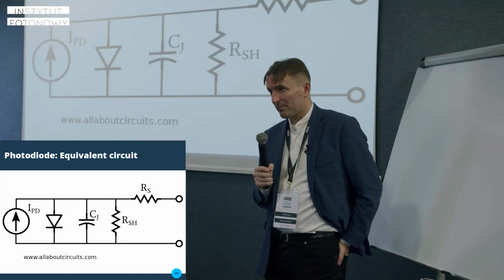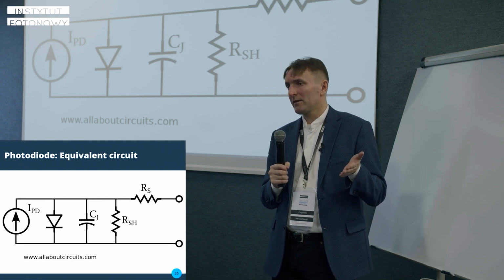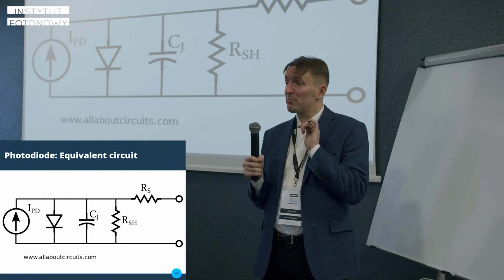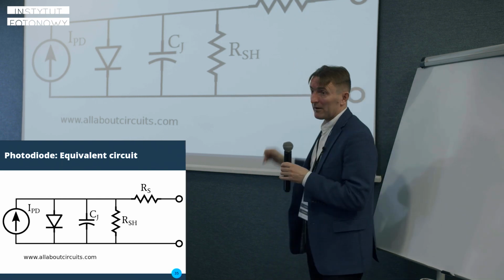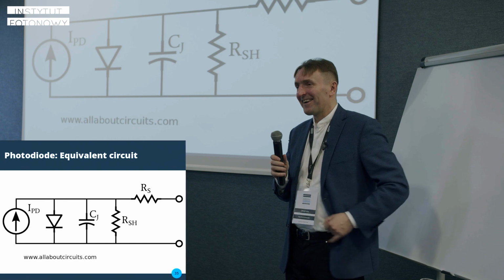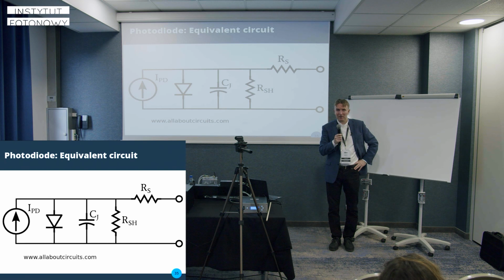So this is a great device. Linear, it's easy to calibrate, and some manufacturers, instead of measuring current produced by the photodiode, measure voltage produced by the photodiode, which is a grave mistake. Because the voltage depends on the temperature of the structure of the diode. Current does not. It also shows that you should really measure the current produced by the photodiode in order to assess how much light it experiences.